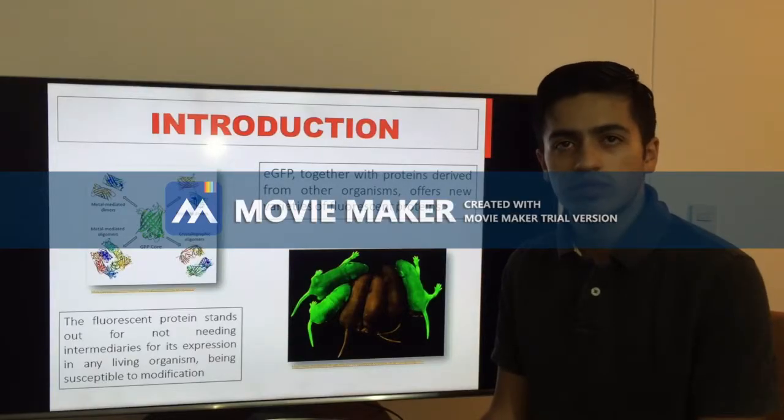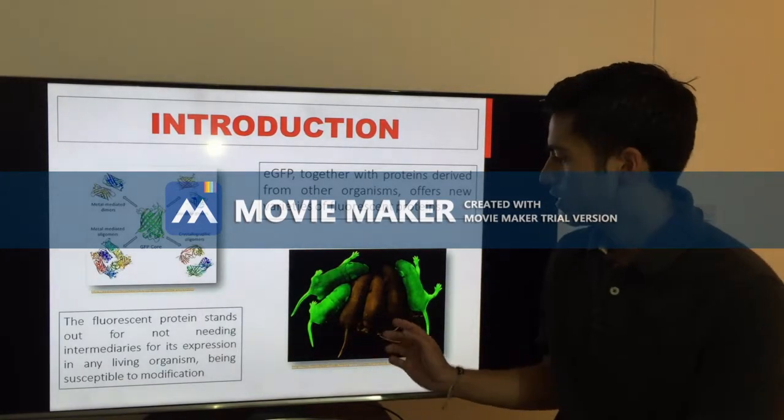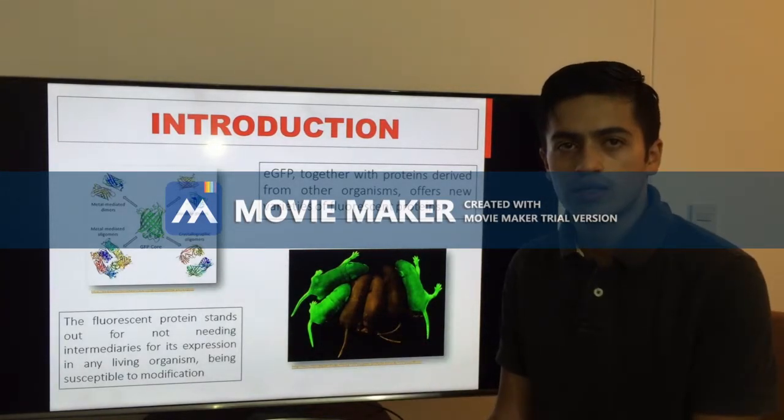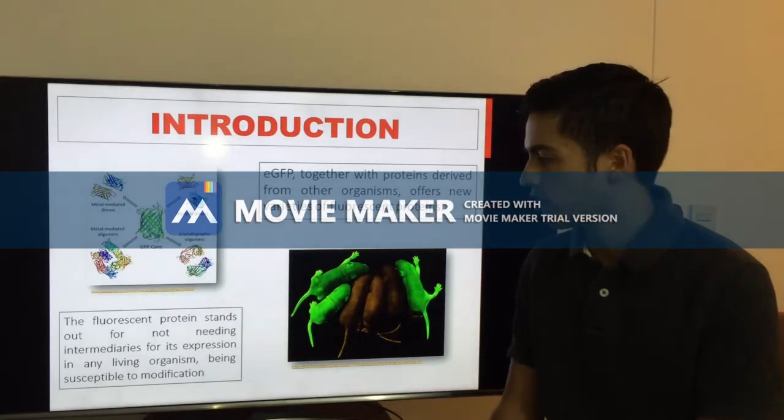GFP, along with proteins derived from other organisms, offers fluorescence, among other characteristics that make it without a doubt special. The fluorescent protein stands out for not needing intermediaries for expression in any living organism.